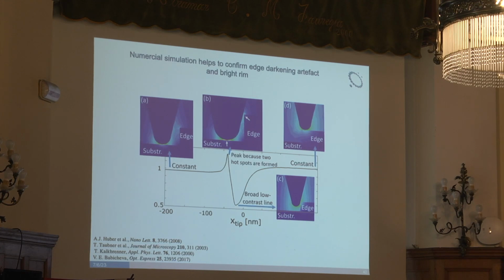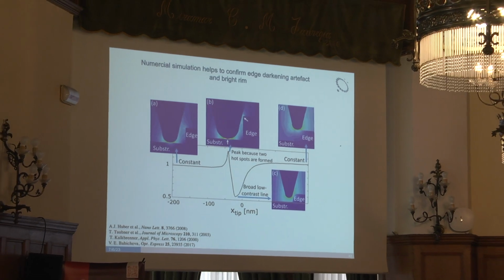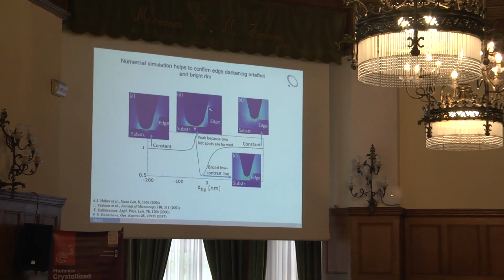Good. So conclusion: better ignore the fringe than interpreting it as whatever, okay? But to be explored, that's an open topic. What is the influence of topography? Depending on how much time I have, I would have even other really interesting examples on how topography can dramatically affect near-field optical contrast.